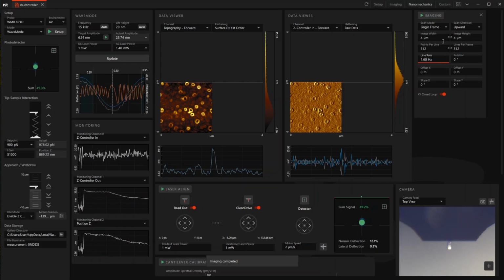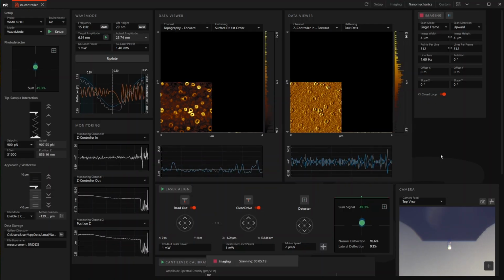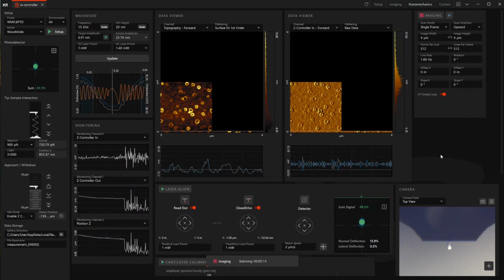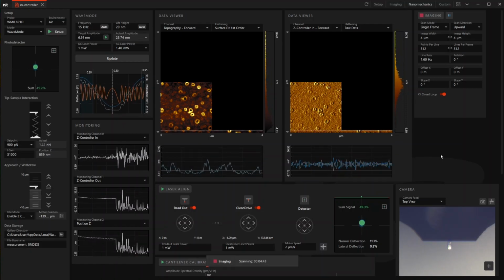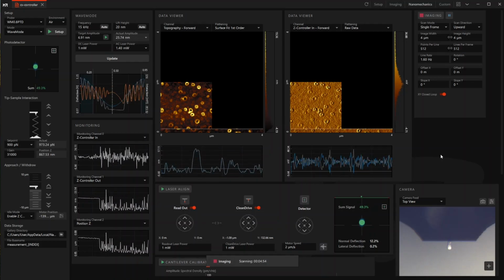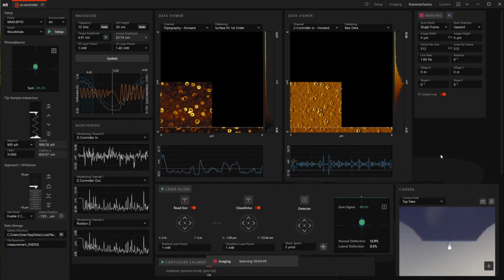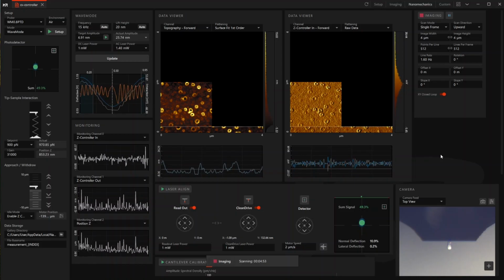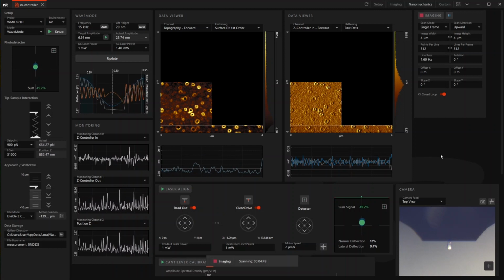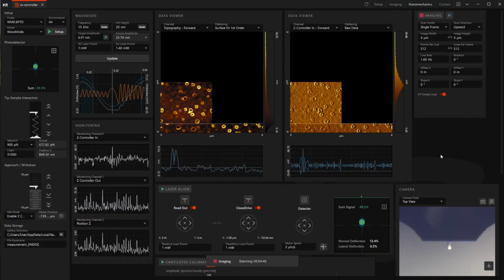If you want every single line to match the trace and retrace, or if you're tolerant to some inaccuracies. Also depends on the height of the structures we're going to find. Most of them are quite small, but now and then there are large structures that go really high. If we want to go faster, we can increase the frequency of the wave mode. But I like these parameters, and I really don't mind taking a little bit longer to capture the data.